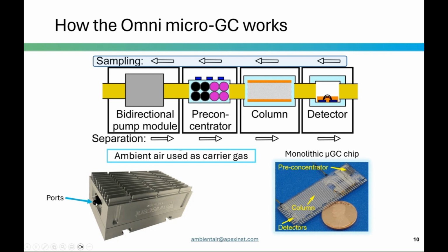You'll see on the lower side here is the sample inlet port. Again, we're just using ambient air as the carrier gas. And then I'm going to play a quick video that shows how the analyte interacts with the monolithic Micro GC chip.